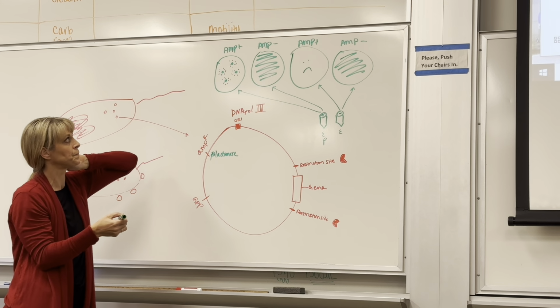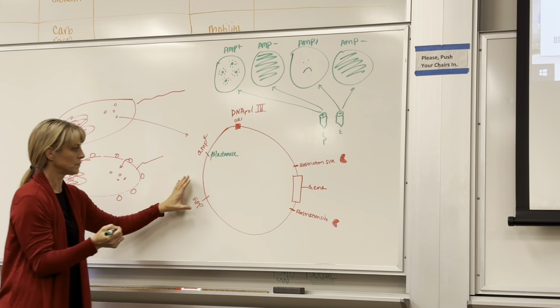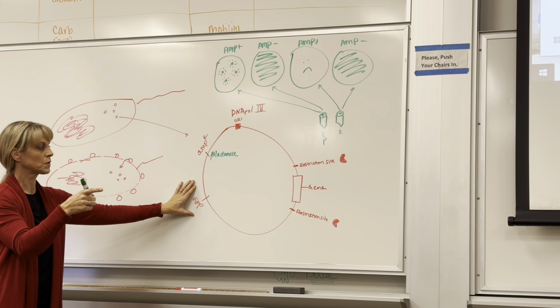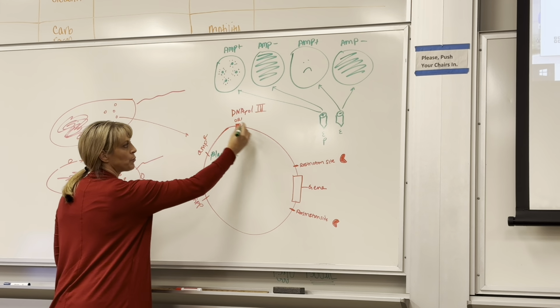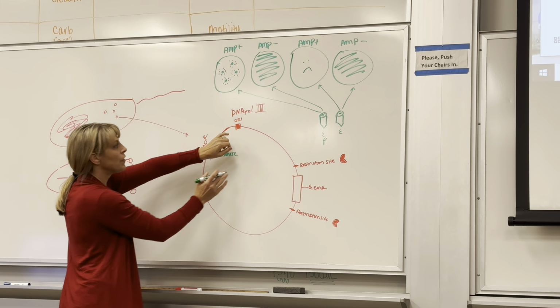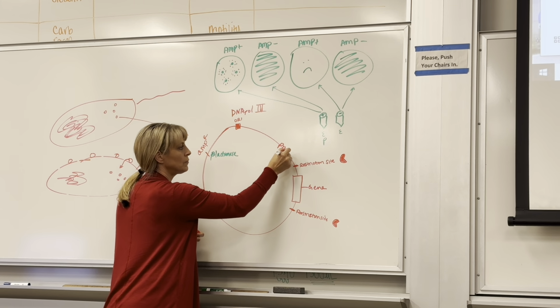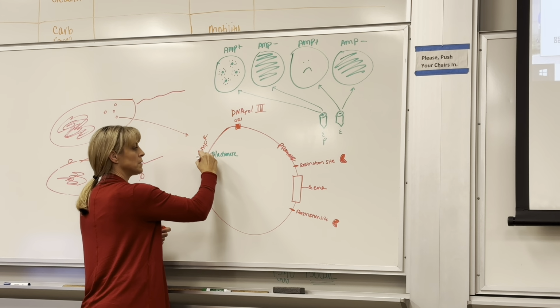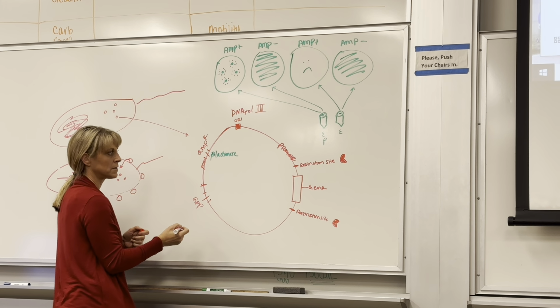The gene that we're inserting into the plasmid, what's included on that? I thought the glow in the dark is the gene that we're inserting into the plasmid, or is it already on the plasmid? Great question. Yeah, it's already on the plasmid. So this is our plasmid, but this is the only funky part of the plasmid. So just ignore this for 1 second. We need an origin of replication. Oh, there's one more thing I forgot, you have to have a promoter. This one has to have a promoter and restriction sites.